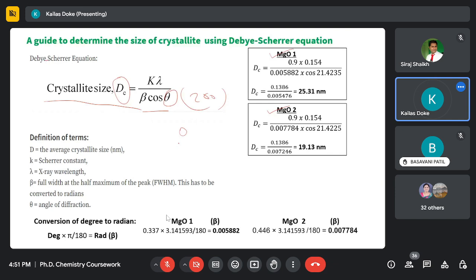In the case of asymmetric structures like monoclinic and triclinic systems, we don't use this particular mathematical calculation because it requires very tedious calculation. So auto indexing using software and computer algorithms is used, and in most research papers, auto indexing is considered.